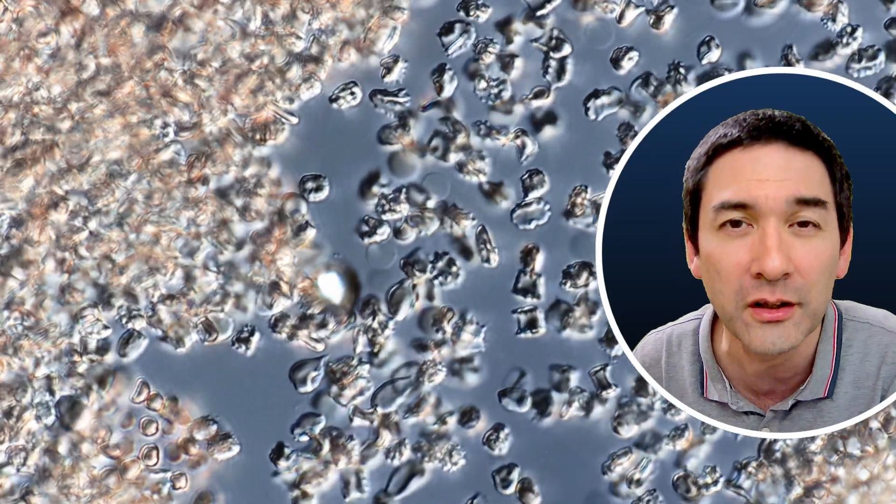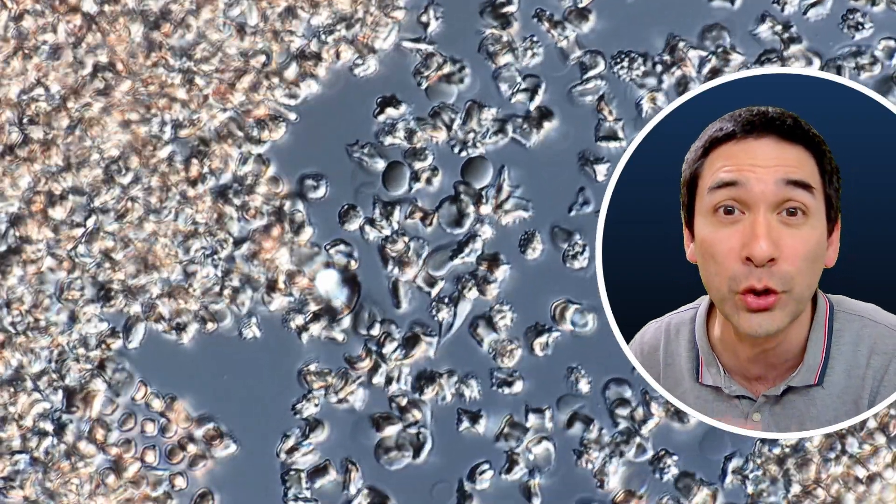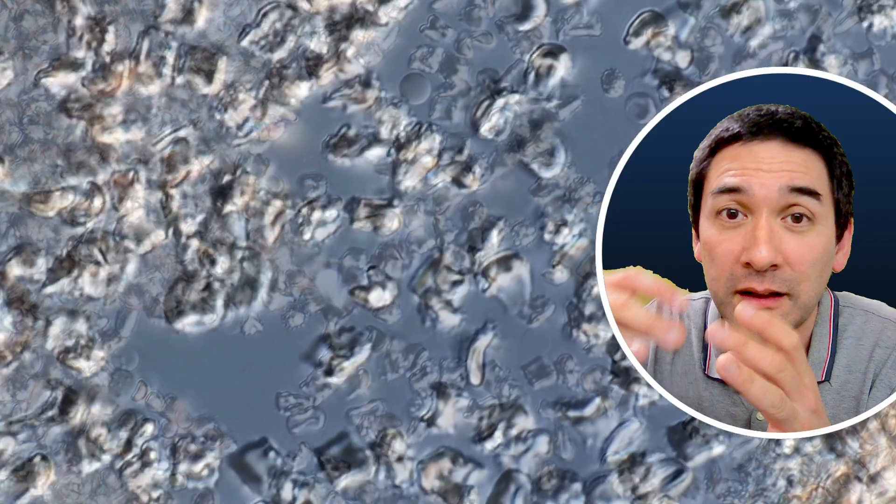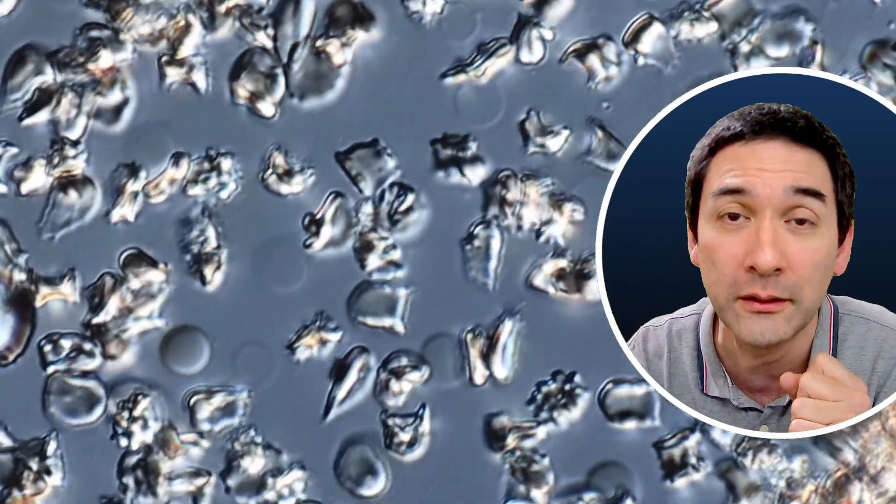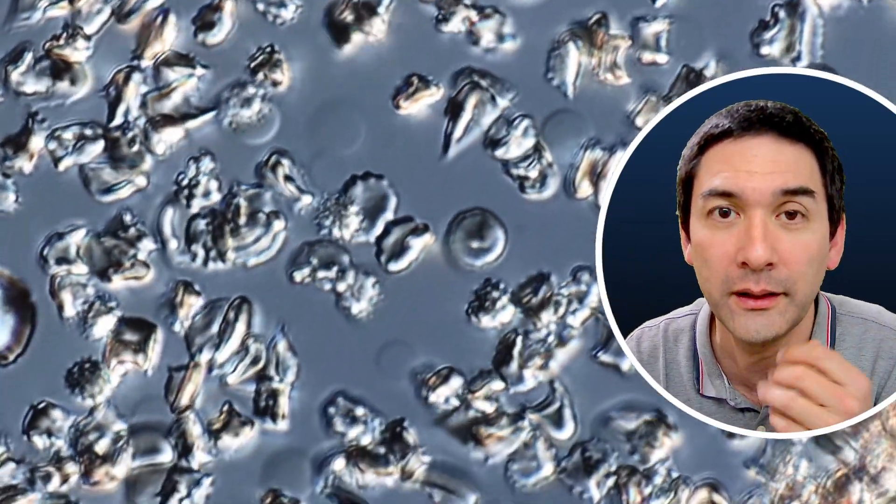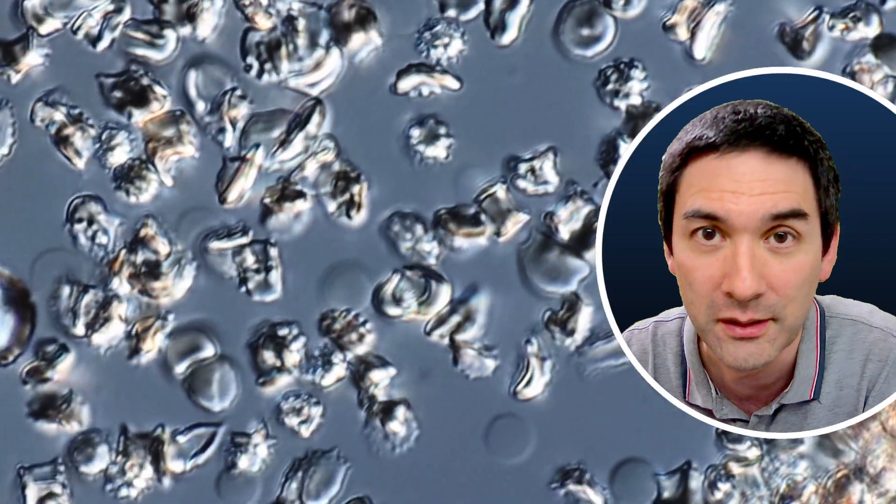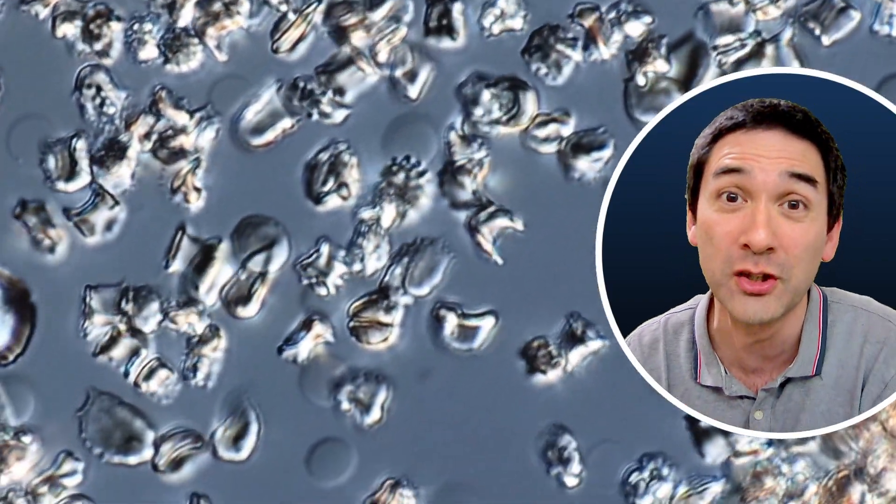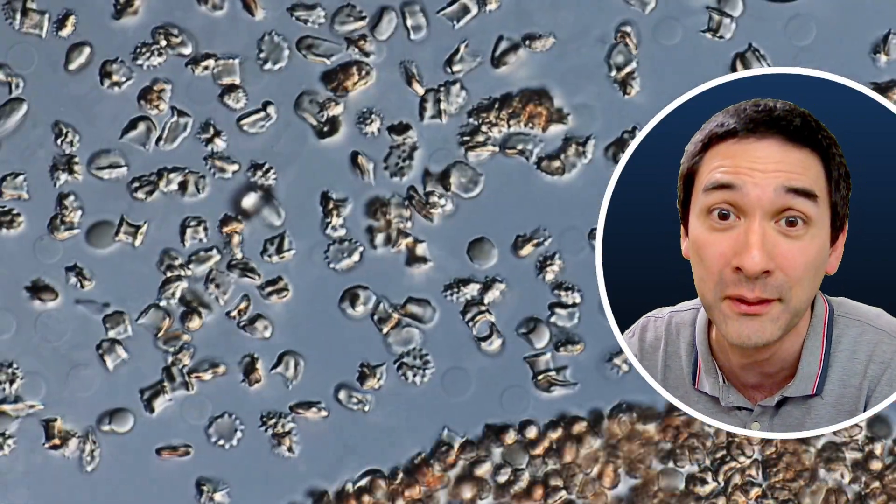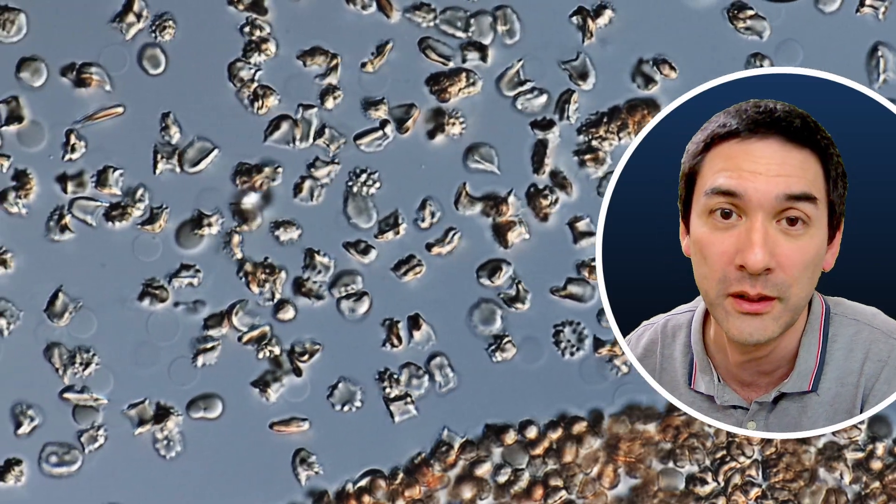They completely lost their nice and round shape and they started to shrivel up and shrink. And they're completely irregular and they look pretty ugly, I think. And then basically that's what happens. And that's one of the reasons why you should not be drinking salt water because I do not want this to happen to my red blood cells in my body.